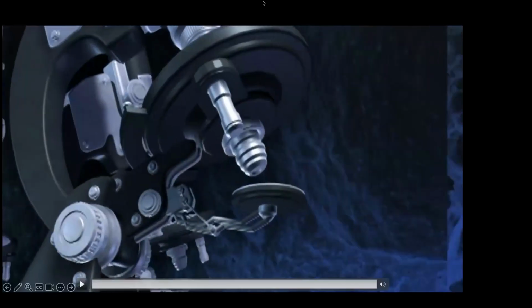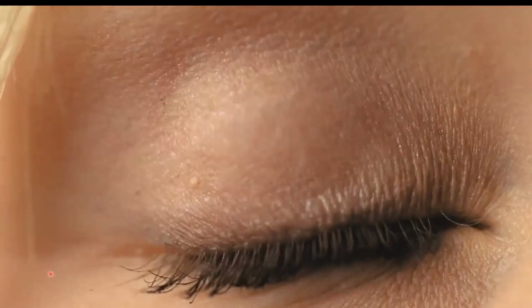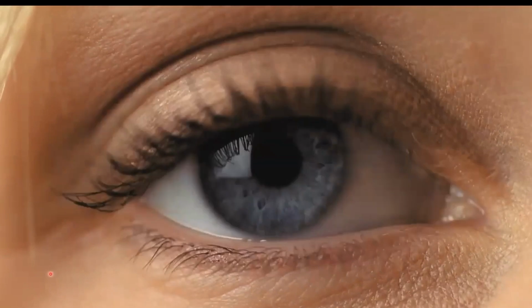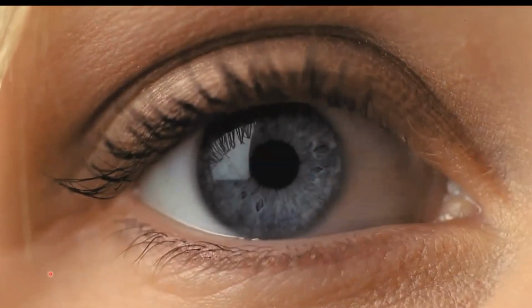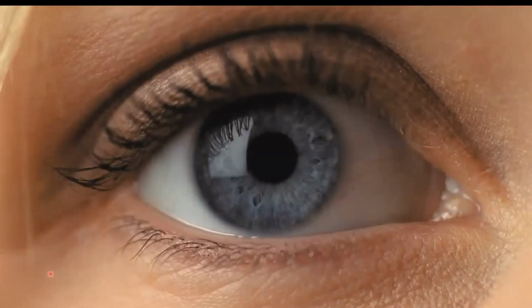Microscopy begins with a simple question: how do we see? Therefore, before we understand why microscopes are necessary or how they reveal the fascinating world hidden from the naked eye, we must appreciate the remarkable optical instrument we carry with us every day. That is the human eye.